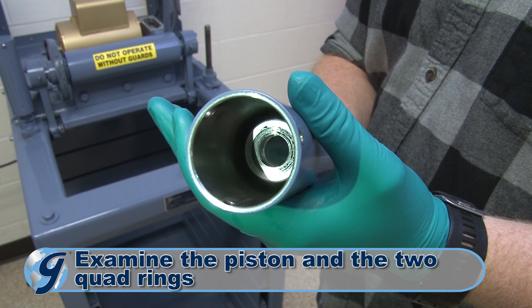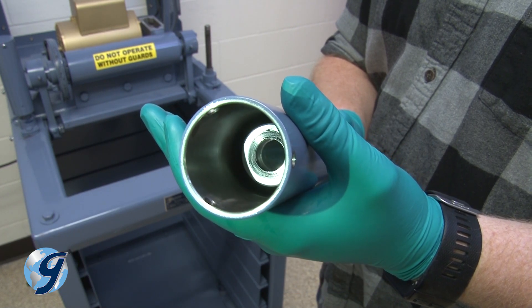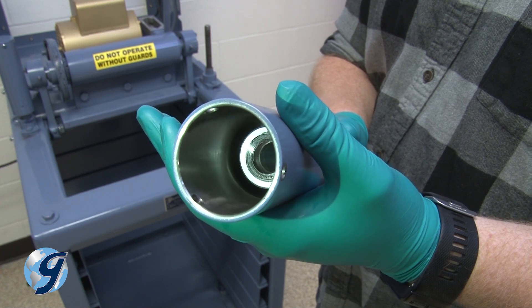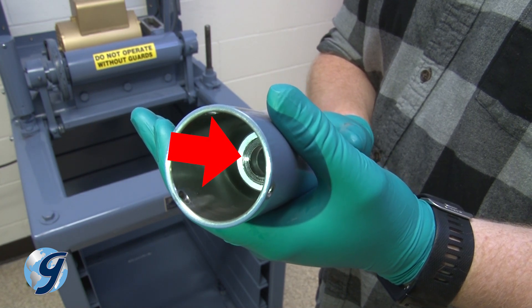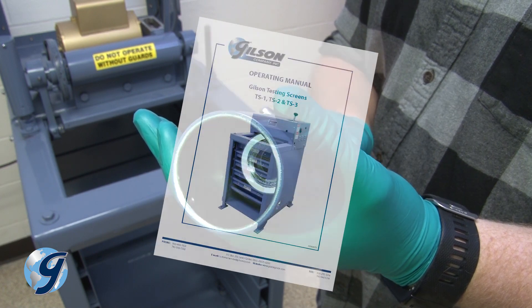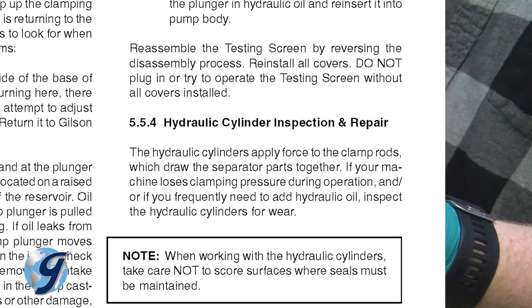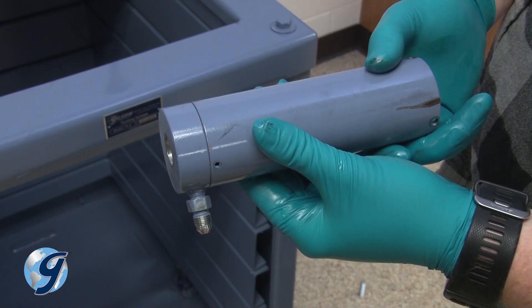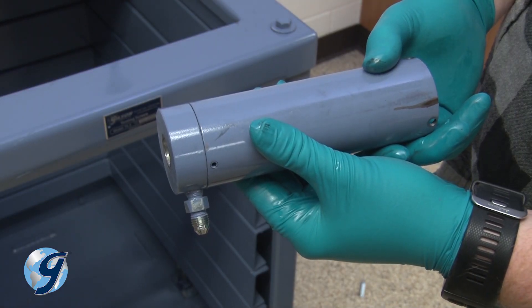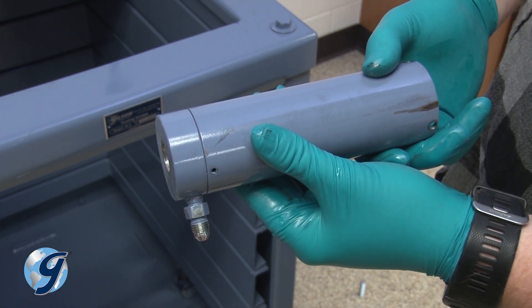Examine the piston and the two quad rings within the cylinder. The cylinder o-ring in the base of the assembly rarely needs replacement. If it is deemed necessary to replace the quad rings or the o-ring, follow the hydraulic cylinder inspection and repair instructions in your operating manual. For this demonstration, we are not replacing the quad rings or o-ring, nor are we removing the piston from the cylinder.